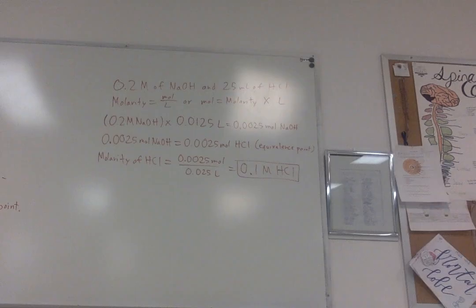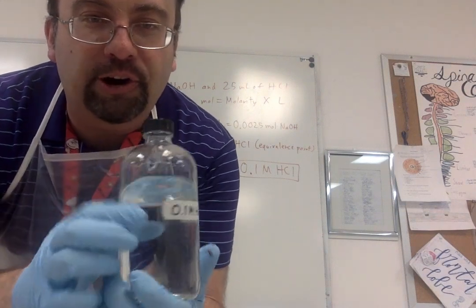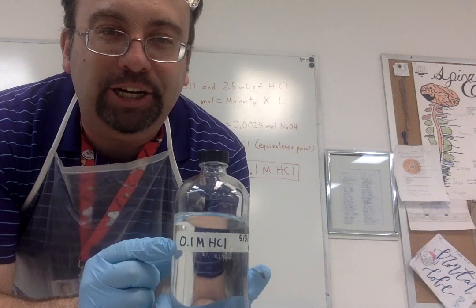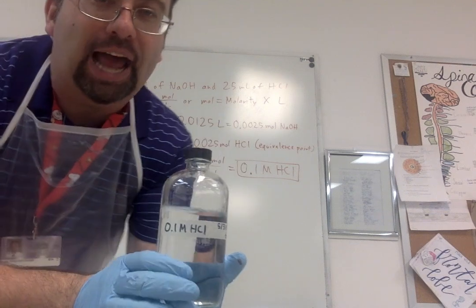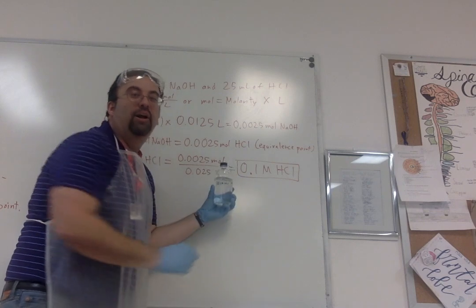And in fact, this was our unknown concentration of HCl. I turn it around, and lo and behold, the concentration of this HCl worked out to be 0.1 molar.